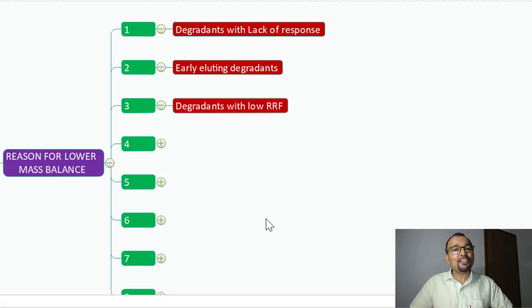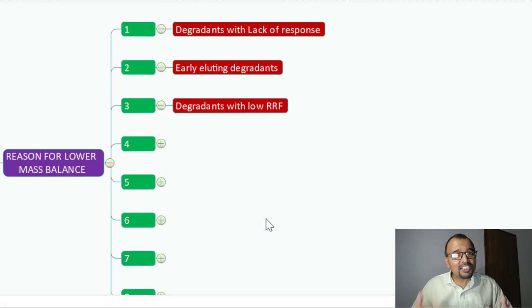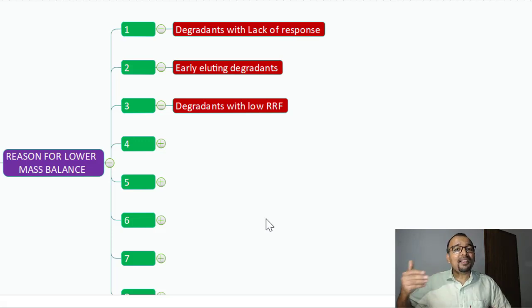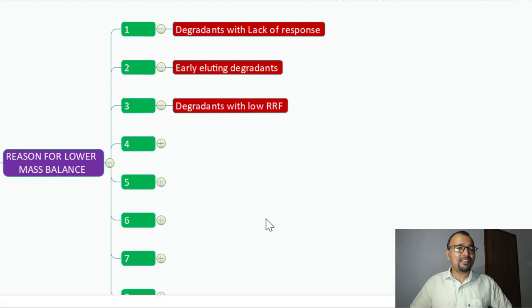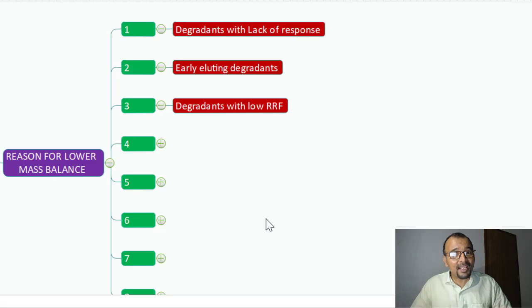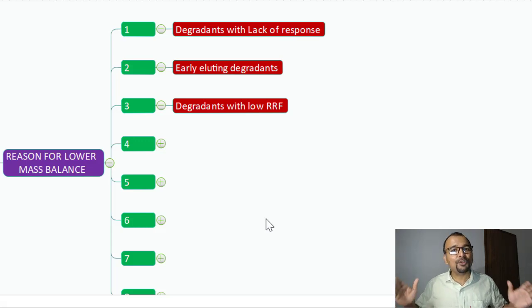Degradants with low relative response factor. You have a degradant which is well separated, but the problem is they have a lower response compared to the API. Because of this lower response, you will end up establishing them at the lower side. In reality, the impurity content may be 15%, but as it has only half the response compared to the API, you will report only 7.5% and lose 7.5% of the potential mass.